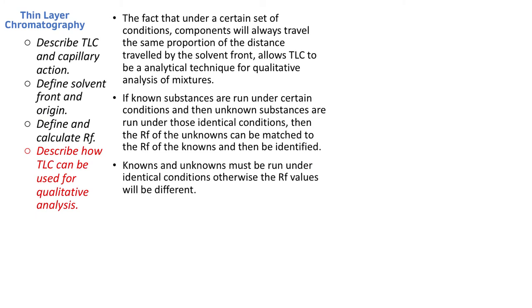Then here we go, next. The fact that under certain sets of conditions, components will always travel the same proportion of the distance traveled by the solvent front allows TLC to be an analytical technique for qualitative analysis of mixtures. Qualitative being like I identify what's in there.